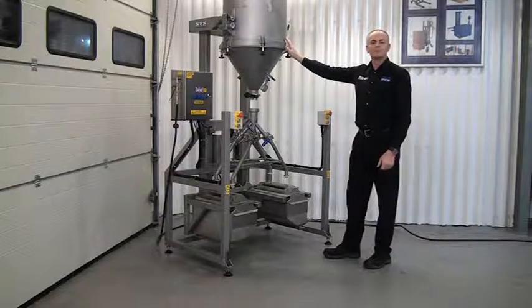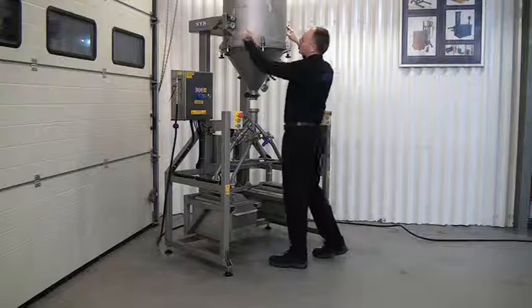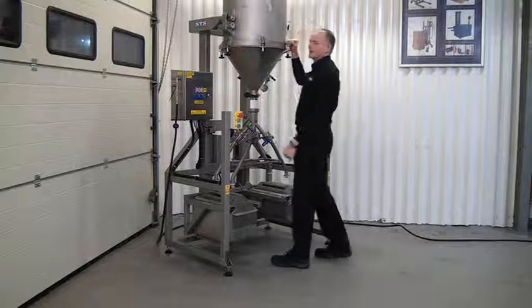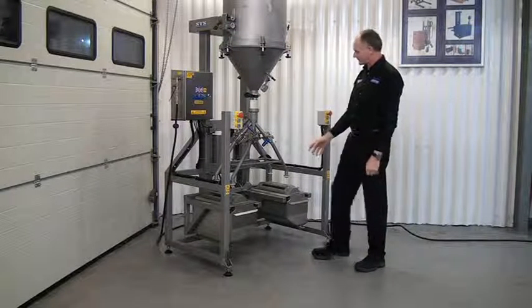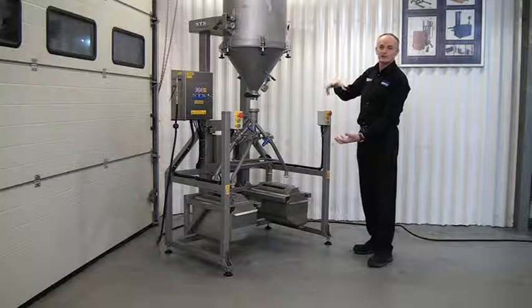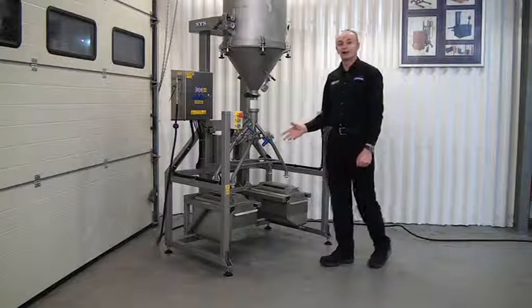This one has already been blended by a drum mixer, lifted up and placed onto these two bars here, and is secured in place by two locking pins you can see there. So you need to check that everything is lined up — we can see everything is lined up — and all we need to do now is bring it all together to make the joints at the bottom and the top before transferring the powder.